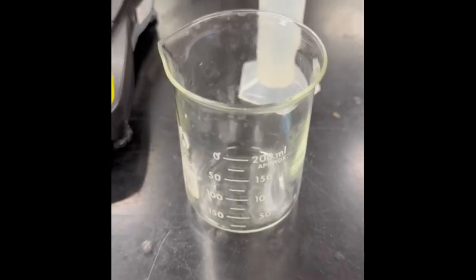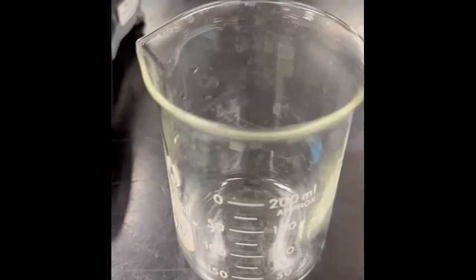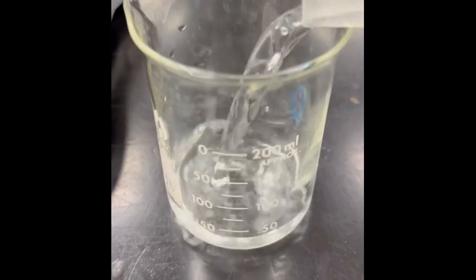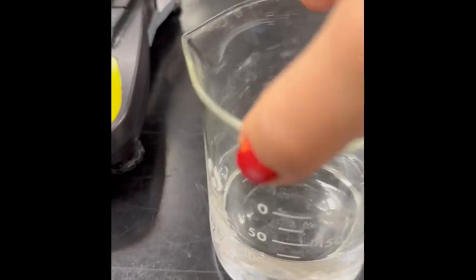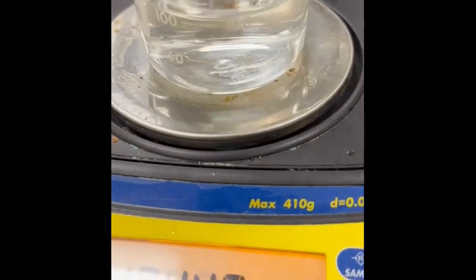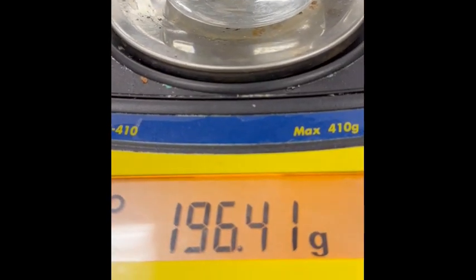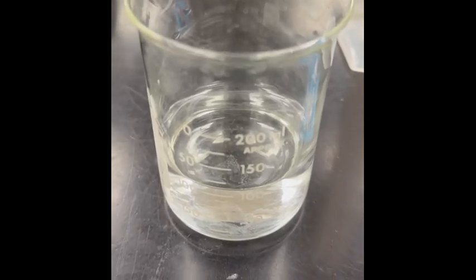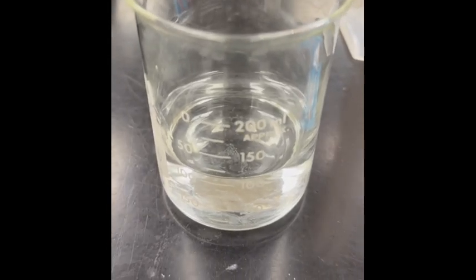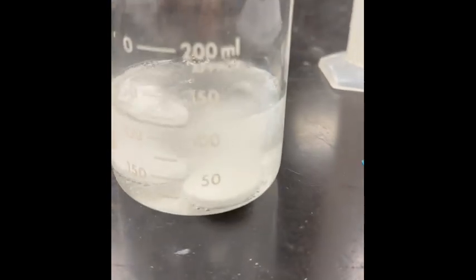I'm going to add 100 milliliters of water to this beaker. And then I'm going to weigh the combined beaker with water: 196.41 grams.